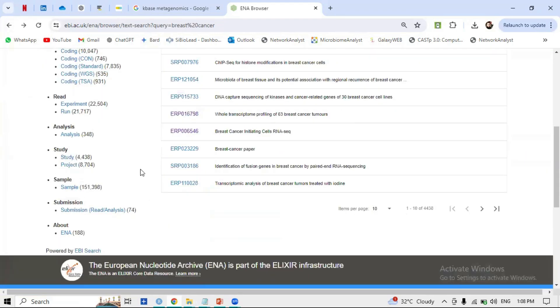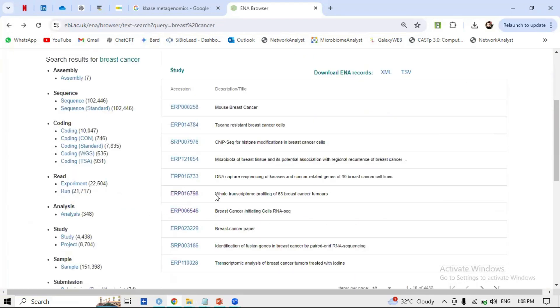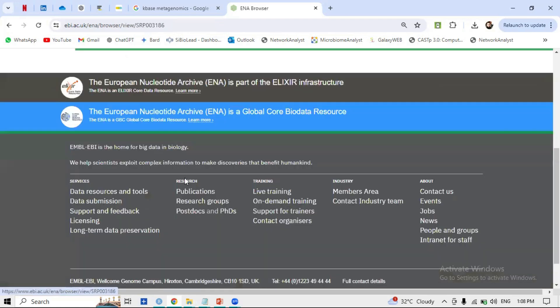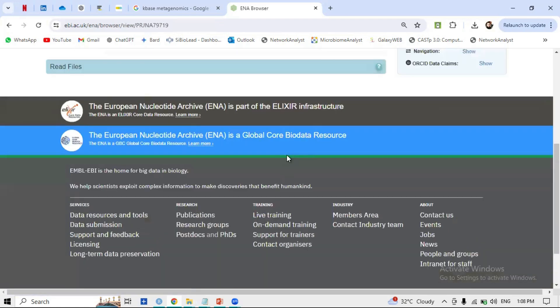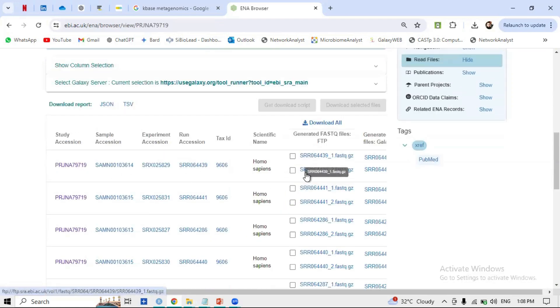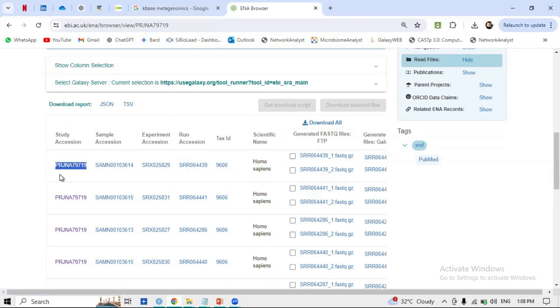Looking through more studies, we find one titled 'Identification of Fusion Genes in Breast Cancer by Paired-End RNA-seq.' Clicking on it, we can see that yes, these are paired-end reads. I explained paired-end reads in the previous videos.